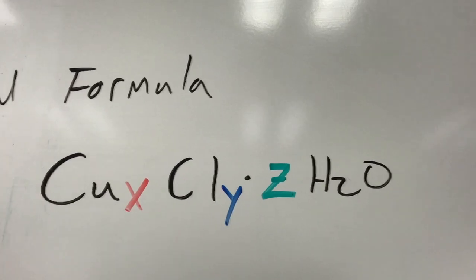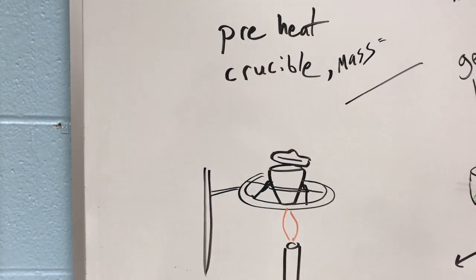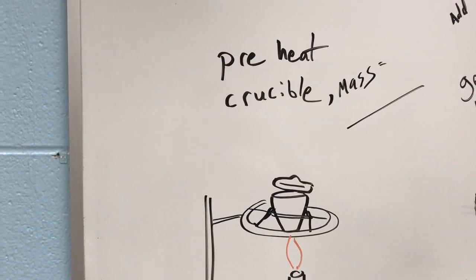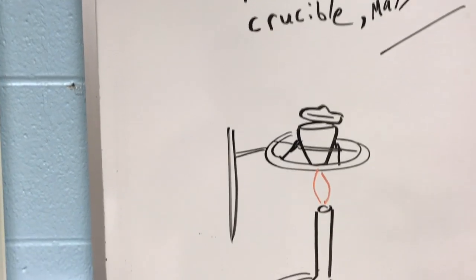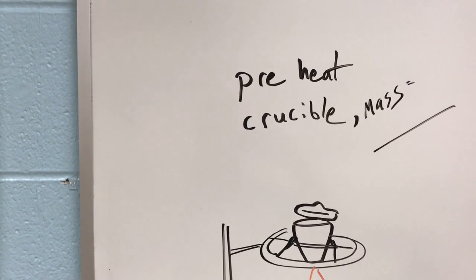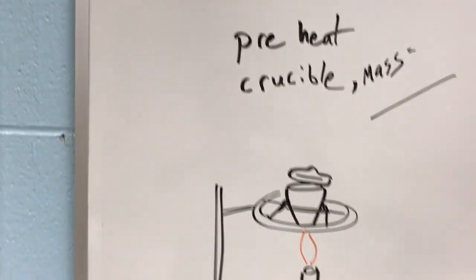So from the start, we're going to need to preheat the crucible. To preheat a crucible, the whole point is to drive off any impurities, any moisture from the crucible so that the mass is actually just the crucible itself. Preheating usually only takes a couple minutes. You always preheat before you weigh the crucible. So we're going to heat it, let it cool, and then write down its mass.